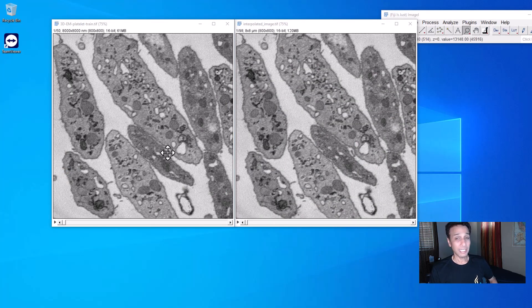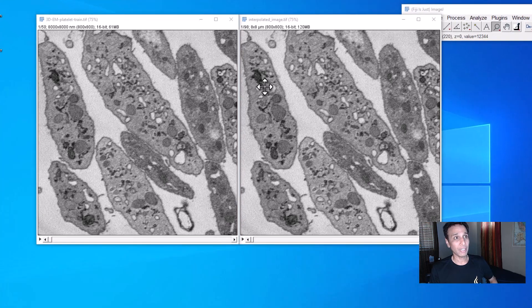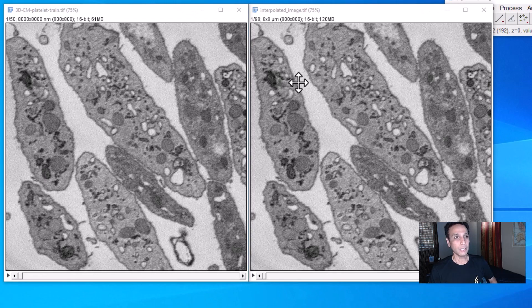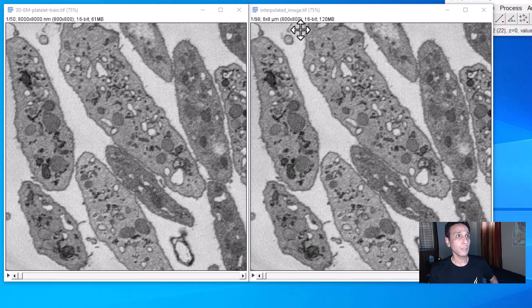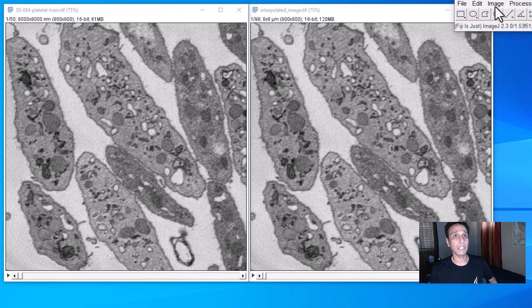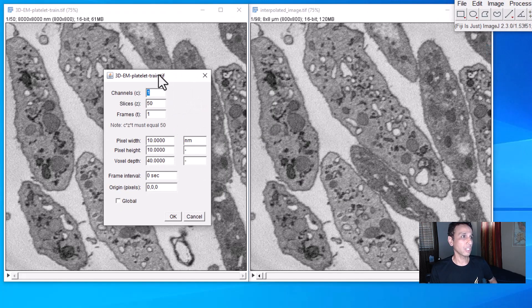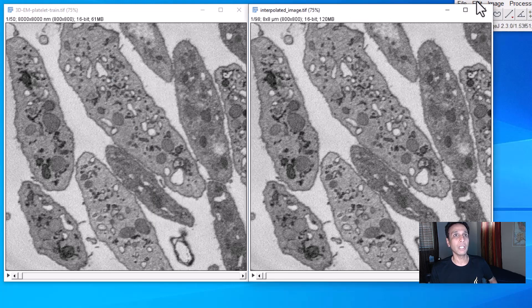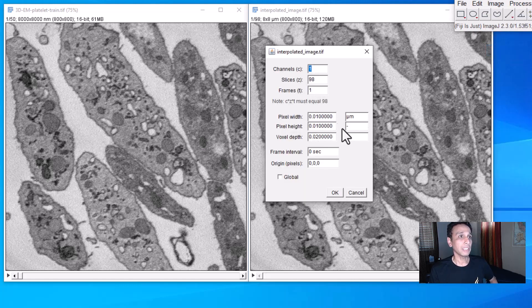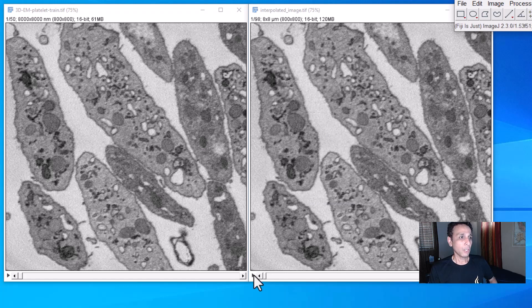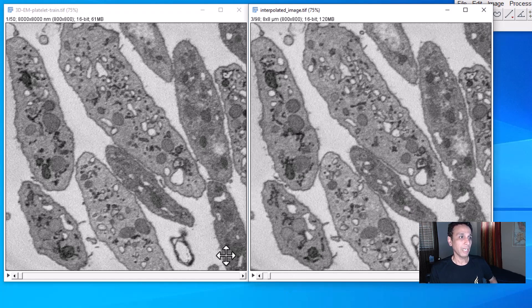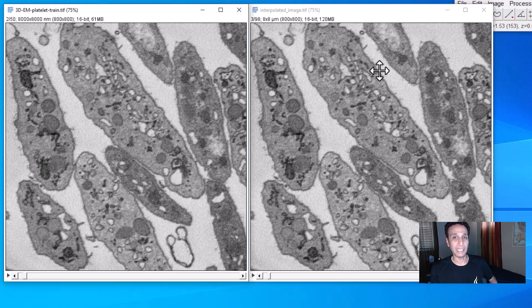On the left is our original image with 50 slices; on the right is the interpolated one with 98 slices. The field of view is 8 by 8 microns. Looking at the properties of the original: 10 by 10 by 40 nanometers. On the right-hand side the properties show 10 by 10 by 20 nanometers. Looking at the first and third slices — they look identical — and the second slice, which we filled in, matches well.